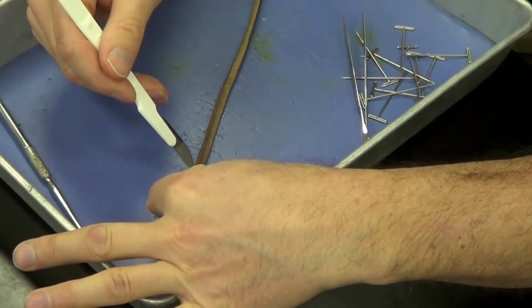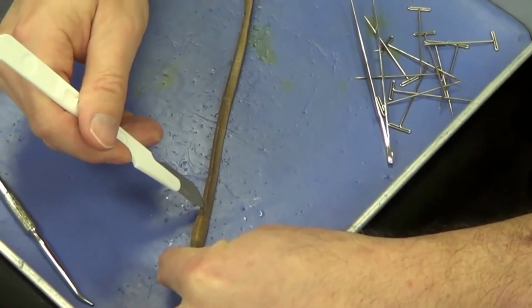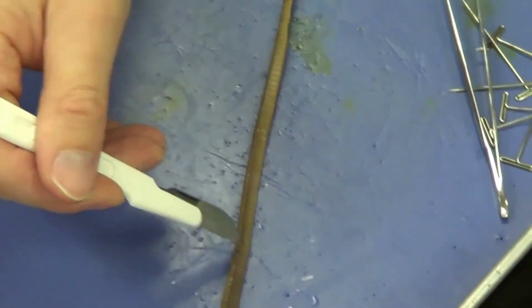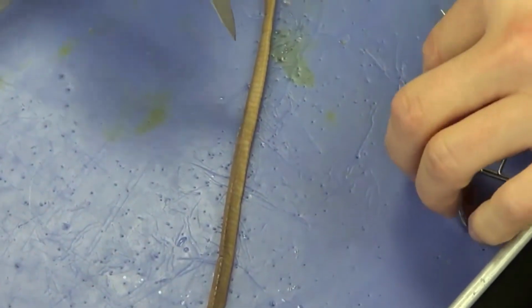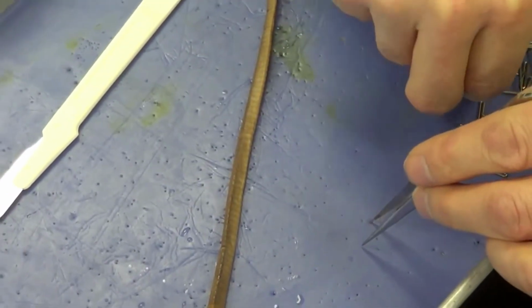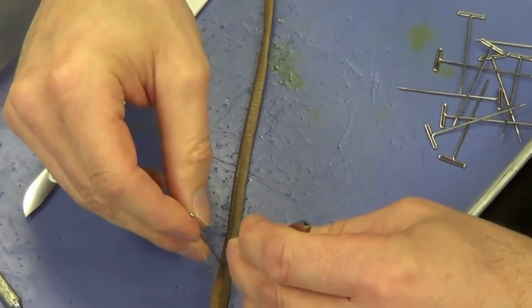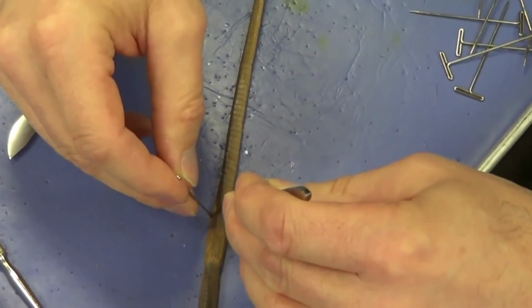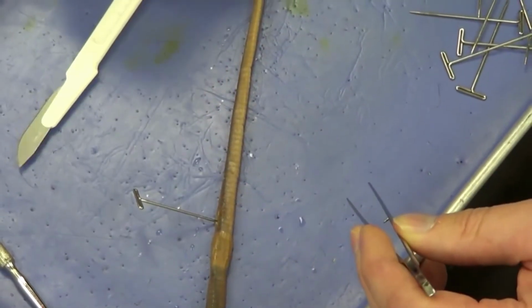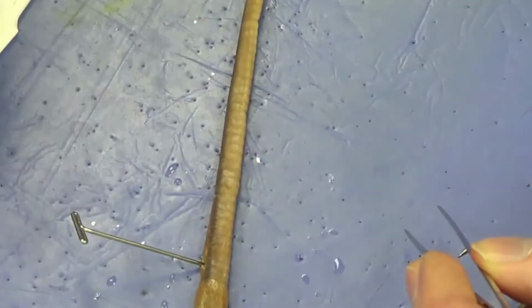And I'm going to start right in the midline, and I'm going to go in very shallow. And I'm only going to cut maybe a 1/2 inch to 1 inch at a time. Very shallow. And then I'm going to take my forceps and try to open that cut I just created up a little bit. I'm going to pull back the skin, and I'm going to pin it. So I'm going to put the pins in probably at around 30 degrees or less. And that way I've got some room to not only see, but to work in here.